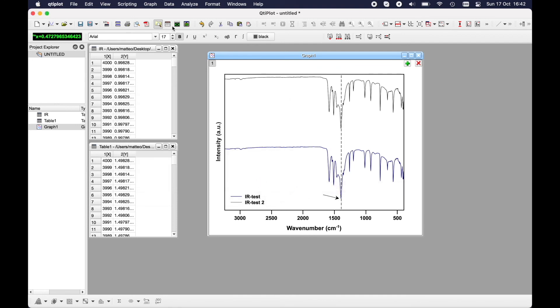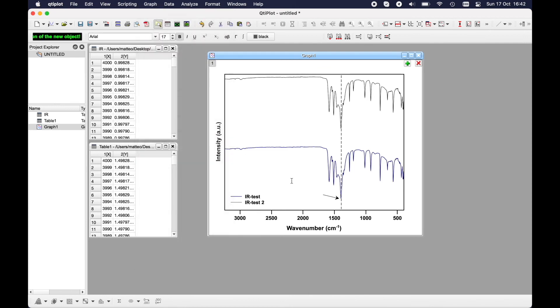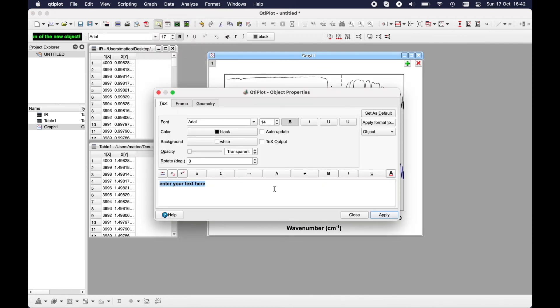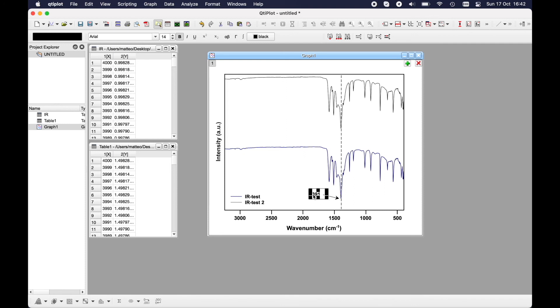And here you can add for example a piece of text. So let's say let's put this and here we go. You can also use your arrow keys and then press Enter to move it, and here we go.